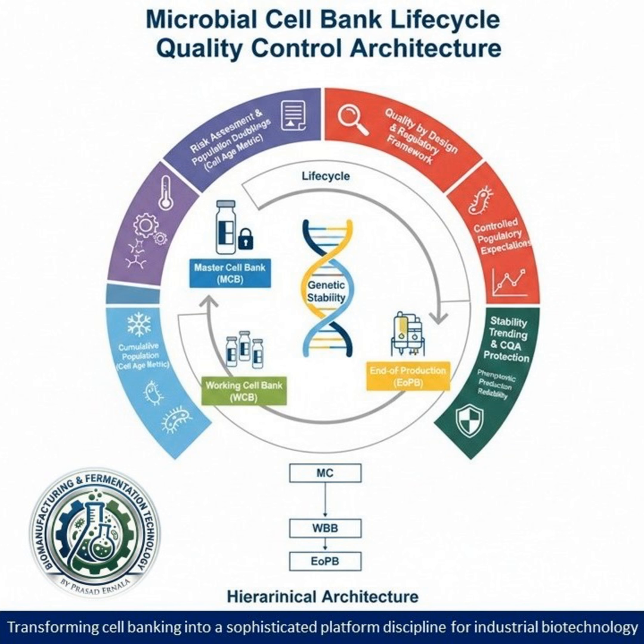What we've seen is that microbial cell banking is so much more than logistics. It's a platform discipline that integrates quantitative science, like tracking CPD, with formal risk management and governance. And while the guiding principles first came from ICH-Q5D for mammalian cells, they adapt perfectly to microbes, with specific additions for things like higher mutation rates, plasmid retention, and testing for threats like bacteriophages.